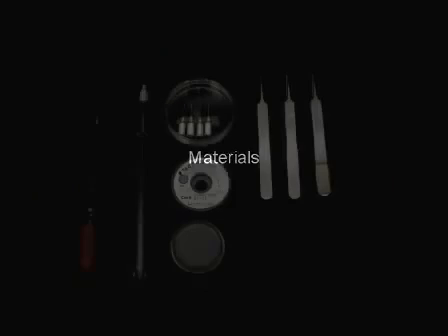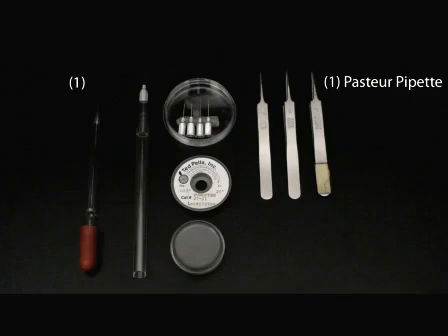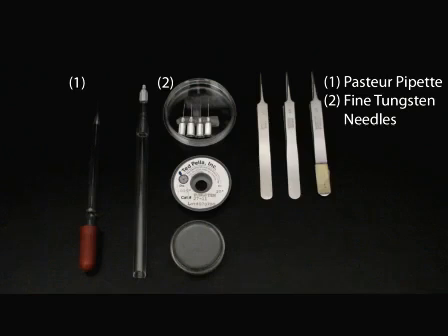For this dissection procedure, some basic dissection tools are required. First, a Pasteur pipette is required for dispensing chilled insect media. Second, tungsten filament is needed for making a fine dissection needle. To produce this needle, the tungsten filament is first inserted through a fine bore hypodermic needle. This provides the tungsten filament with needed support. The tungsten is then passed slowly through a flame. This acts to burn off some of the tungsten at the tip, creating a very fine and very sharp needle.